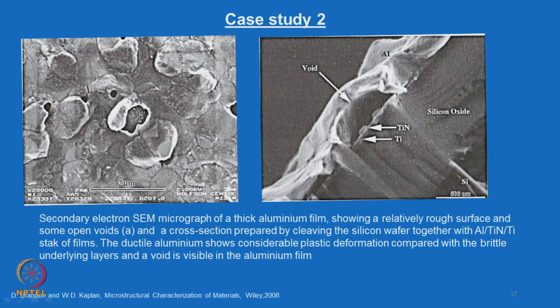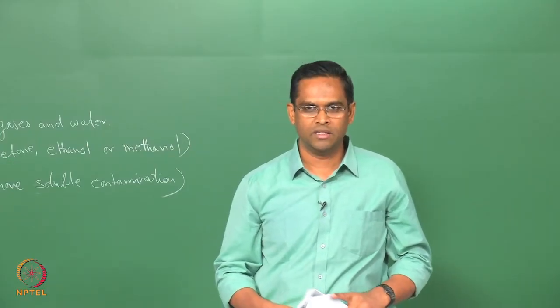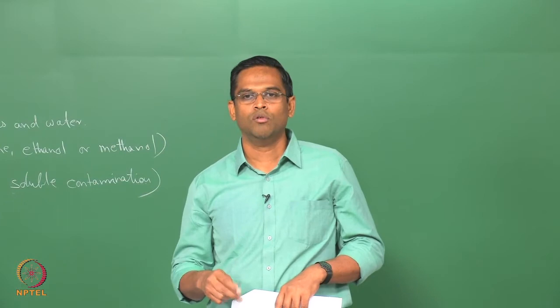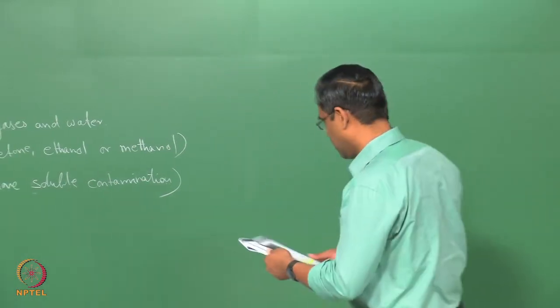And on the coating, the kind of defect it forms during the coating is also clearly analyzed during this kind of SEM examination. So, that is another example where you can use this SEM more clearly. I will write some salient features of this.